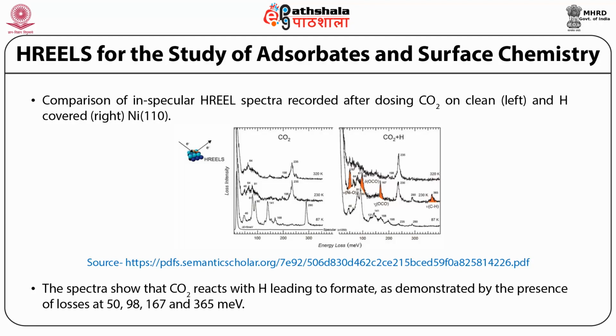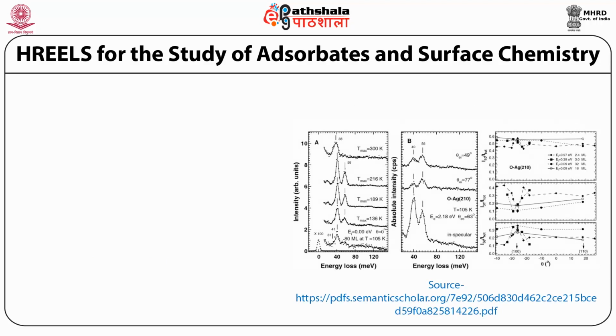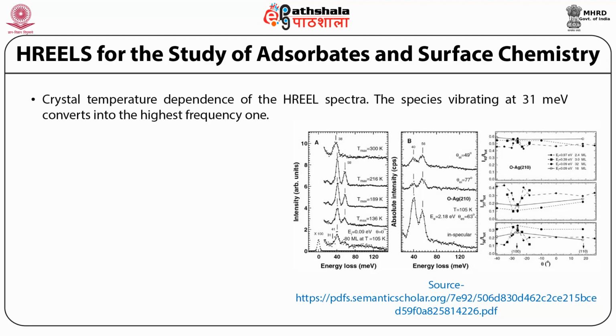This has been indicated for two surfaces in this particular slide. This also gives various kinds of adsorbates on these surfaces, or as we say, on targets. It is given in figure A. It is a crystal temperature dependence of the HREEL spectra. The species vibrating at 31 milli electron volts converts into the highest frequency one.